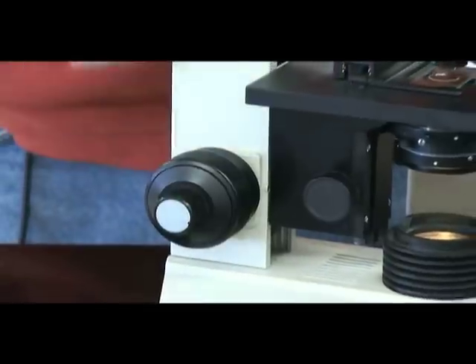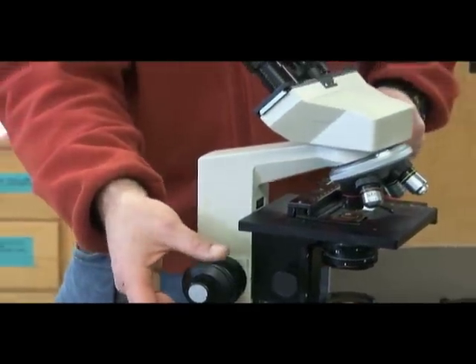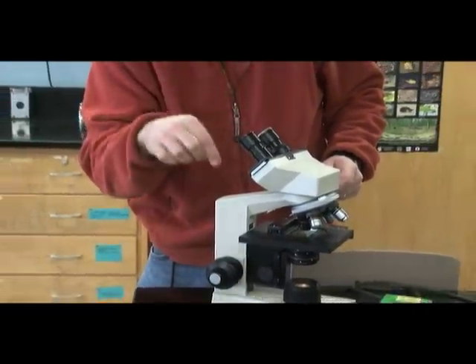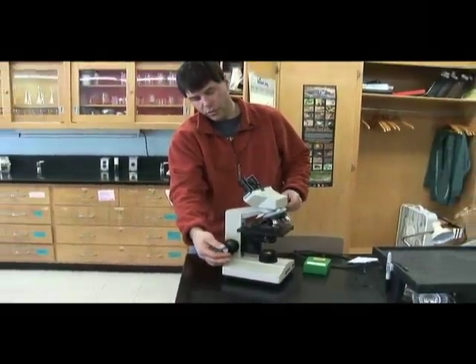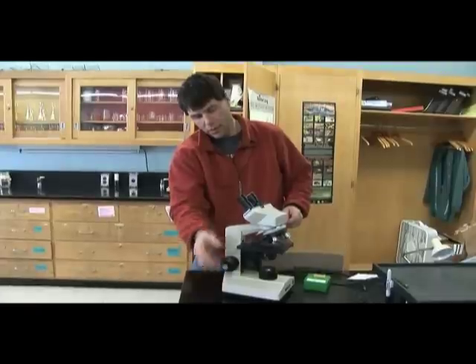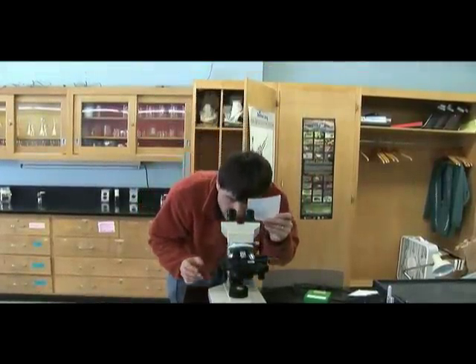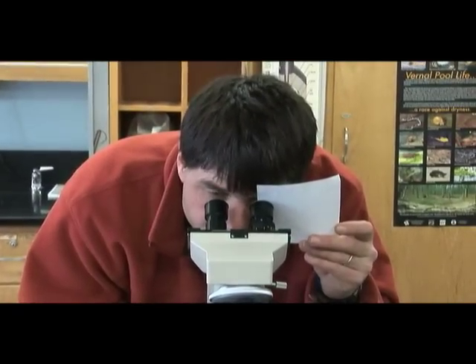This will keep you from accidentally breaking the slide by over focusing or focusing too closely to your subject. You can easily break the slide. So always use the fine adjustment knob there.